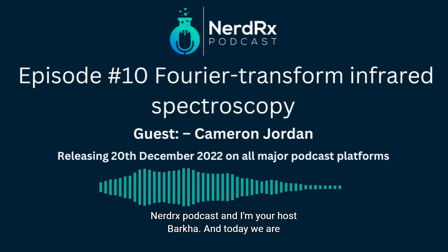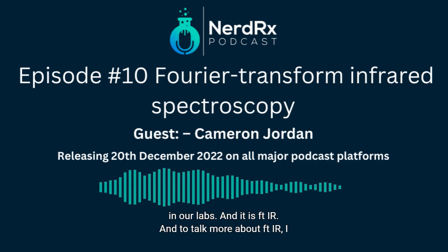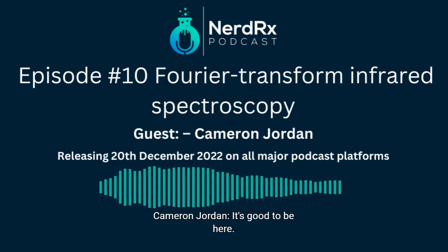And today we are bringing you another technique which is very, very widely used in our labs, and it is FTIR. And to talk more about FTIR, I have today Cameron Jordan with us. Welcome, Cameron, to the show. It's good to be here.